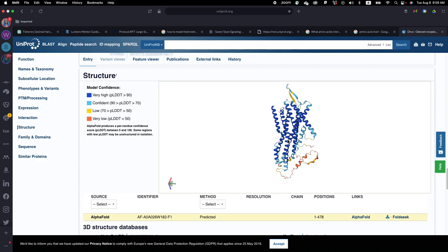And then, yeah, when you get your PDB file for your first file that you want to analyze in Chimera, send that PDB file to me and I'll look at it in Chimera and make sure that I can identify something.